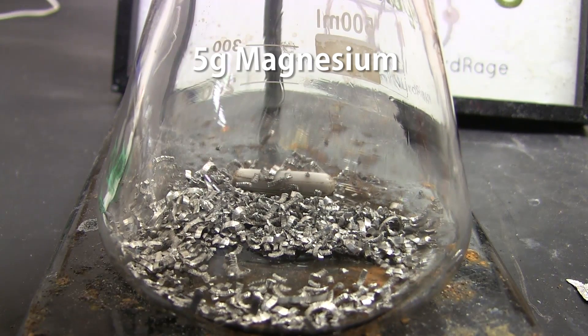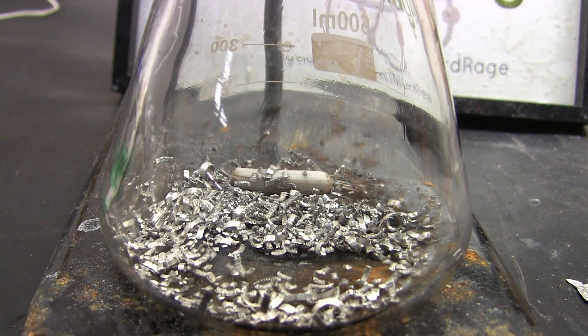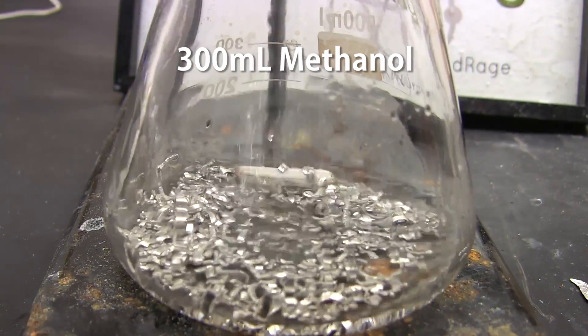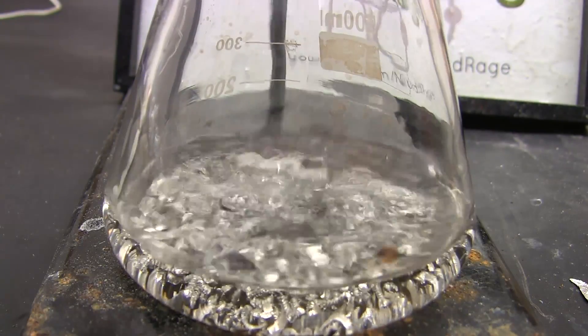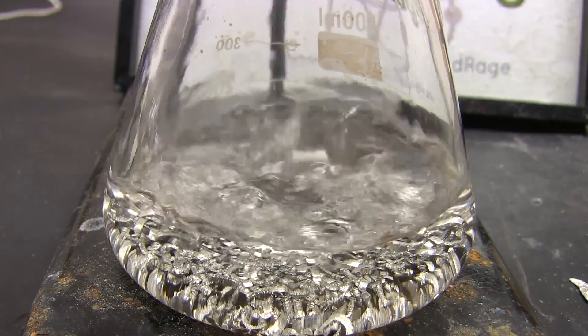We start with 5g of magnesium metal turnings in an Erlenmeyer flask. These can be purchased online or made from magnesium fire starters. You can even use magnesium ribbon if that's cheaper. Now we add 300mL of methanol — I'm doing methanol for demonstration but this method can be used for any alcohol. Before beginning any drying process you should start with the driest solvent you can get by simpler means.